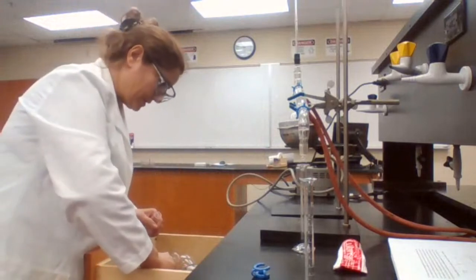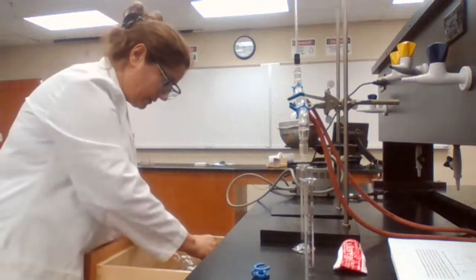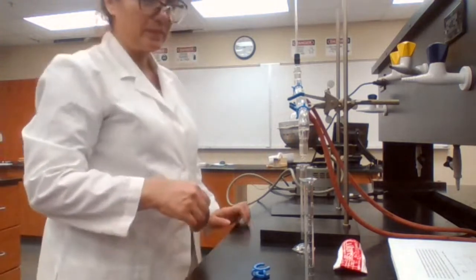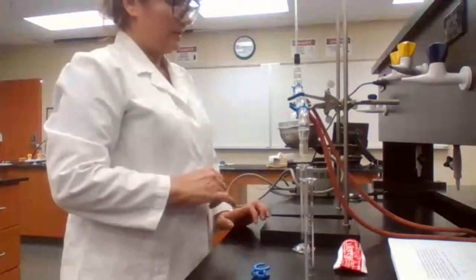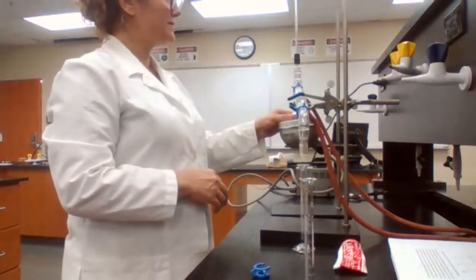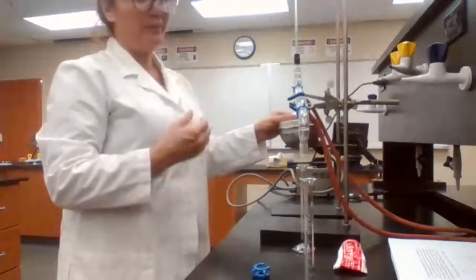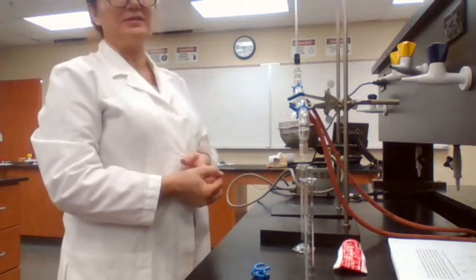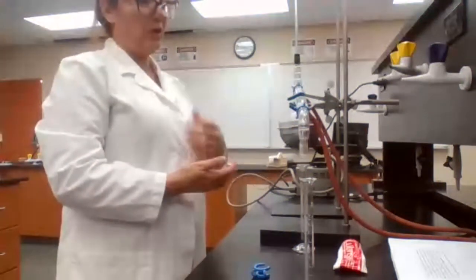Now, the next question that I asked you was, what is the purpose of gentle heating? You cannot heat too high, too fast. There are a couple of reasons for that also. These are good points that you could use for your discussions, because now you know how to write the discussion. It's just the whys and hows and control conditions.